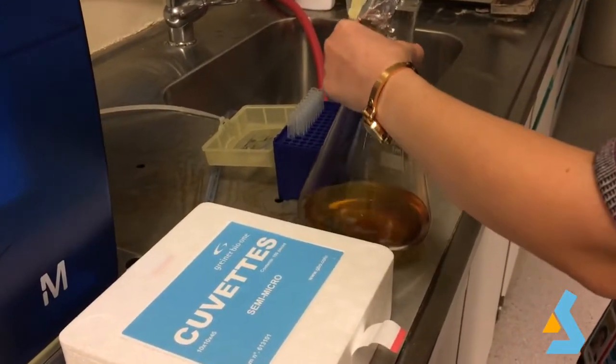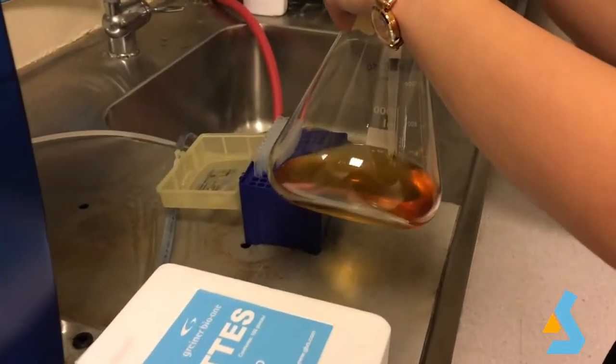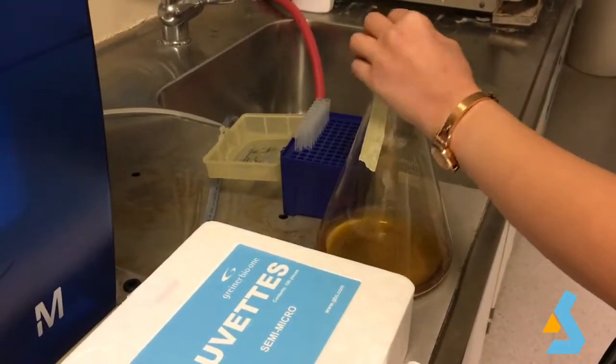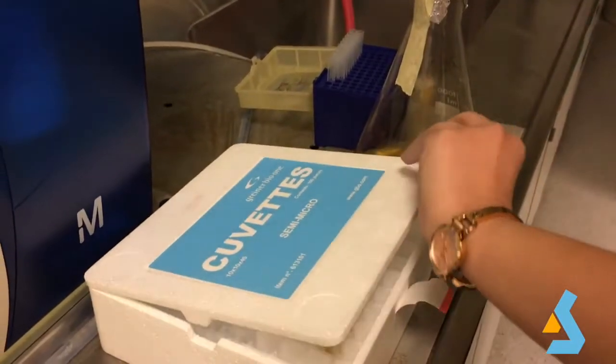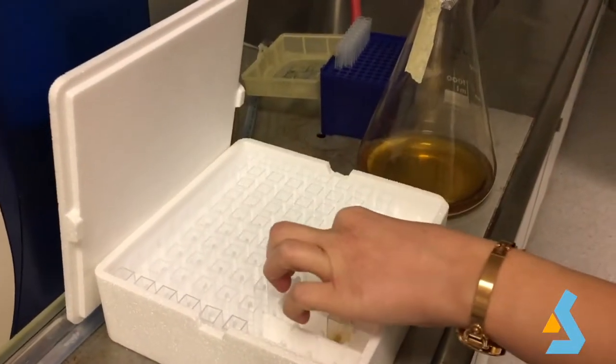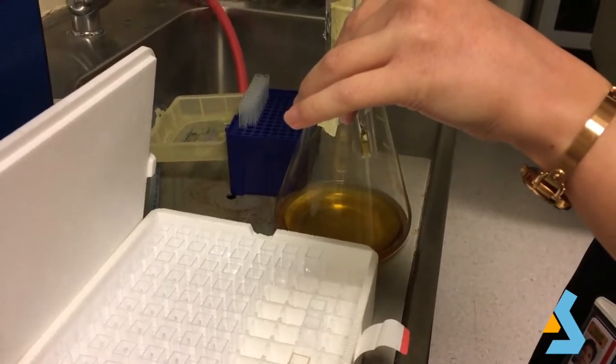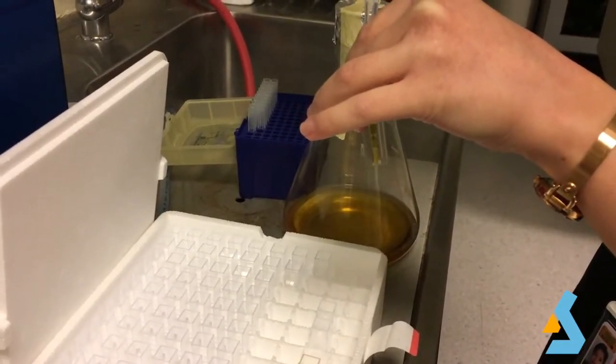Moreover, the cuvettes that we use are also appropriate for a defined wavelength, which means that it will not reflect the light. This wavelength also minimizes interferences from yellowish broths. Take 1 ml of culture each time and place in UV cuvette. Be careful not to form bubbles in the cuvette during the process.